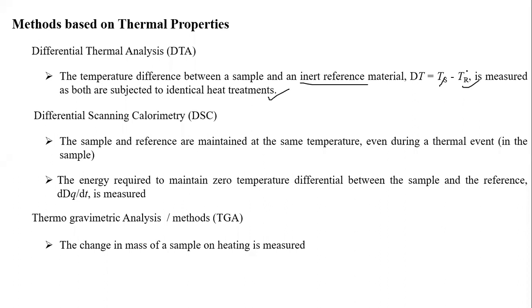Reference sample means we know the properties of that particular sample. We will heat our unknown sample, collected from the soil, and the reference sample. We know all the properties of the reference: at what temperature it will melt, at what temperature it will go for other chemical reactions, everything. We will have proper knowledge of this. So we will compare. Up to 1000 degrees, what changes happen between them? By comparing with the reference sample, we can identify what kind of clay mineral is there.